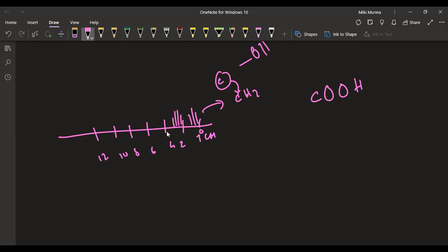Okay. Now there we have what? How many hydrogens are there? 3 hydrogens, because there are 4 peaks. But we also should consider this singlet as well. This is in between whom? 11 and 12. From the data booklet, one value that resembles this is 9 to 13, and we are in between this region, 9 to 13. That means this could be a possible carboxylic acid.